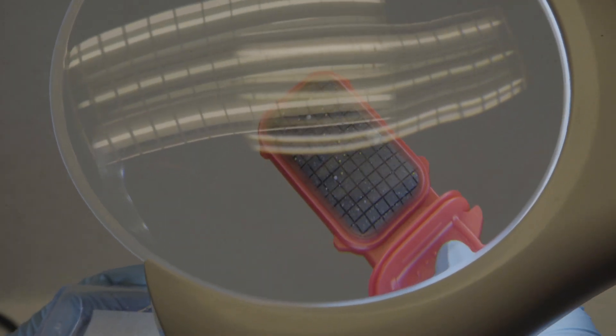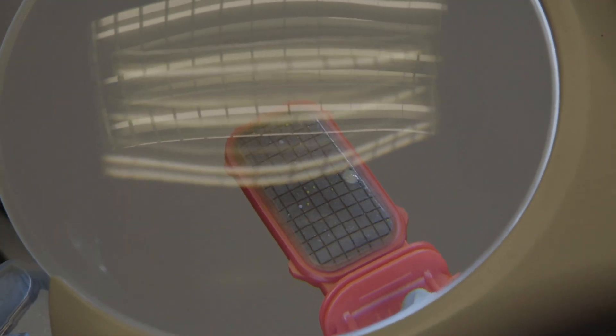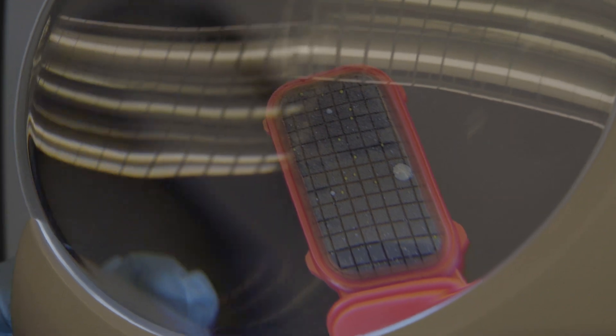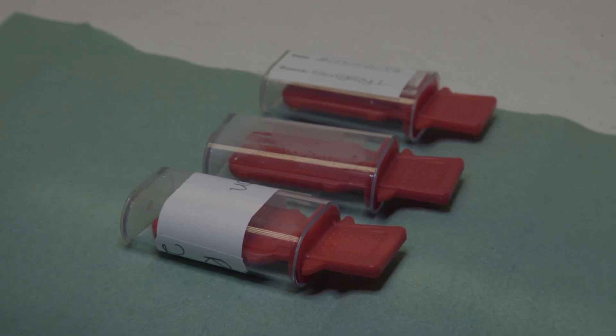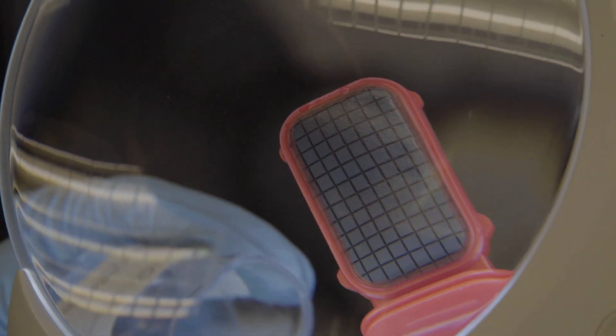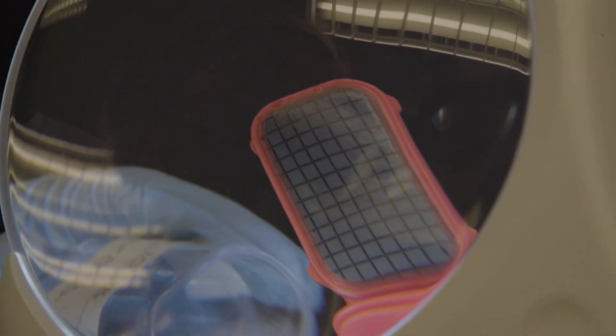After this time, count any dots that have appeared on the sampler. It is best to use a magnifying lens or to photograph the sampler. Angling the sampler may help avoid flash from the lighting, making it easier to identify colonies.